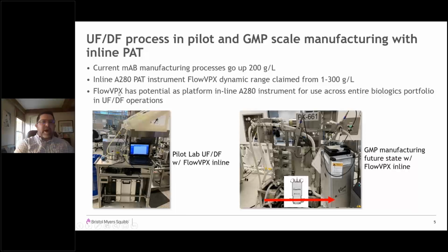One of the great aspects of this inline flow meter, if I may call it that, is that it has potential as a platform tool for inline A280 measurement across the entire UFDF operation. That's one of the reasons why we've come to respect and use the FlowVPX: there are no limitations, and there's no model building either. It's pretty much plug and play. I'll talk a little about how you do method development further into the talk.